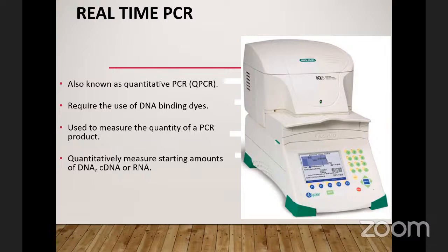In this case, as the PCR is running, you are seeing amplification happening. So if a reaction is going to take 2 hours to be complete, and after 30 minutes, there's actually amplification on a particular sample, you are able to know that this sample is amplifying and is going to be positive. So real-time PCR is a very powerful tool in research, in diagnosis, in disease monitoring, and in quantification, you know. So you are able to detect PCR product in real time.